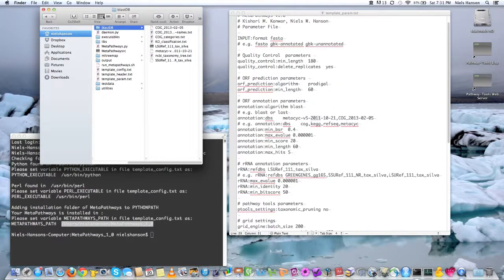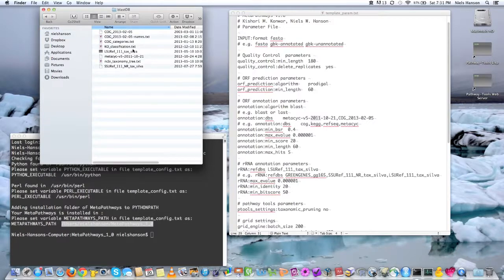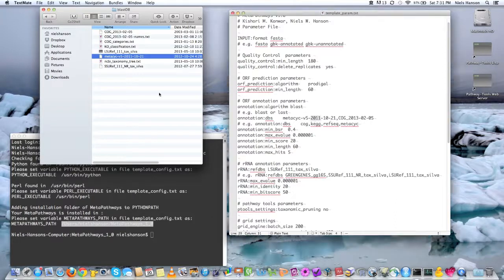Is this file right here. And so these names have to exactly match. Even if it's off by a little bit, it won't pick it up properly. What it does is it looks for FASTA files that have that name in your BLAST database folder, and then it will try to format the database and do that. It'll do all the nasty BLAST stuff on the fly for you, but you have to get the names nailed down right here.